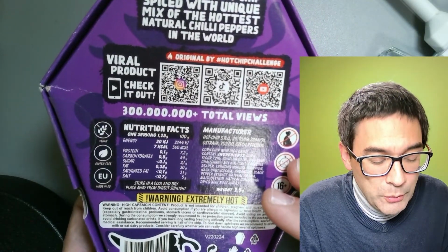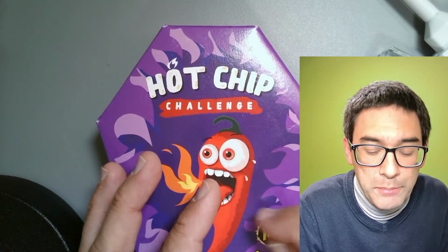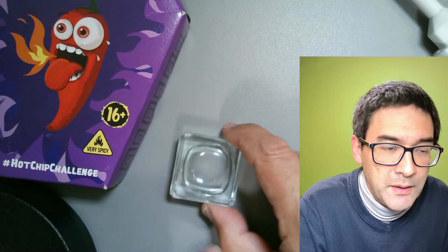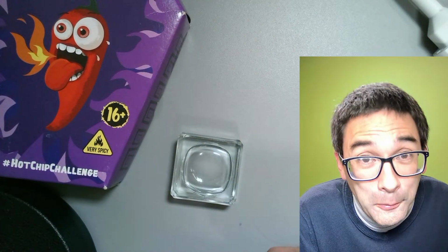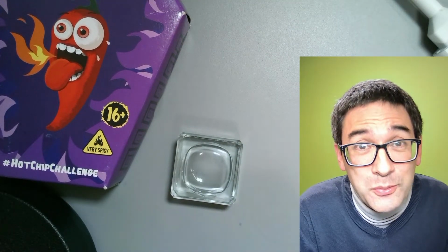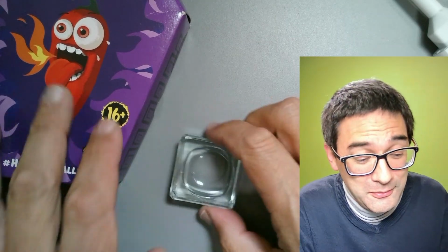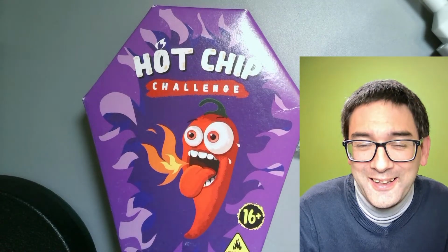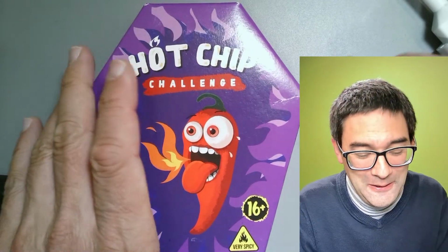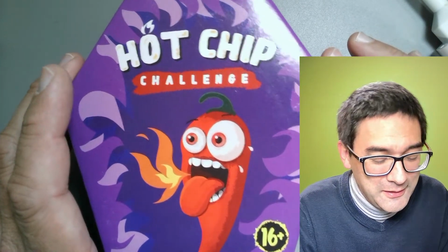And what I'm going to do now is take a small piece of this chip, put it in this dish here, mix it with a little bit of water, as I mentioned before, hoping that some of the substance will dissolve in the water. And then I'm going to feed it to some of the little critters that I have here. Okay, that's the idea. Generally I don't mind eating spicy food, but if it hurts too much, then it's also not fine.